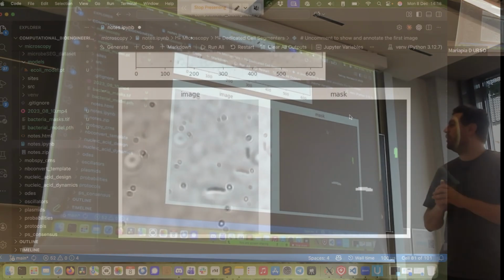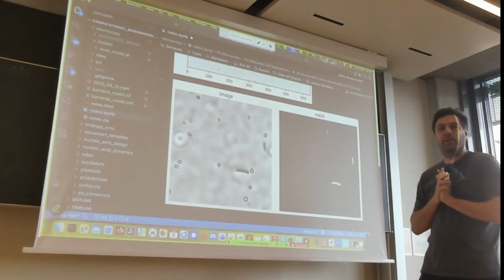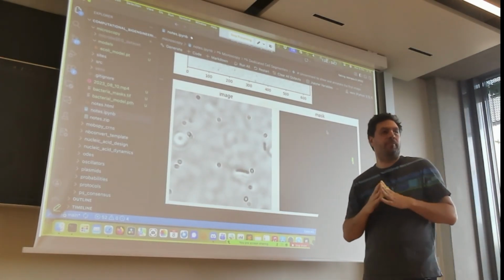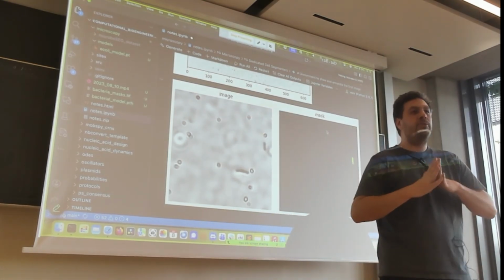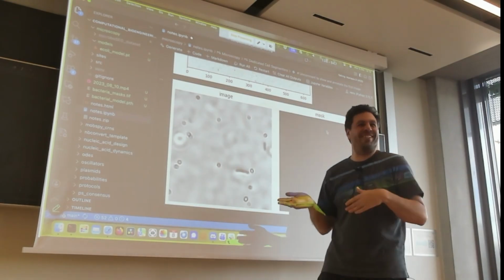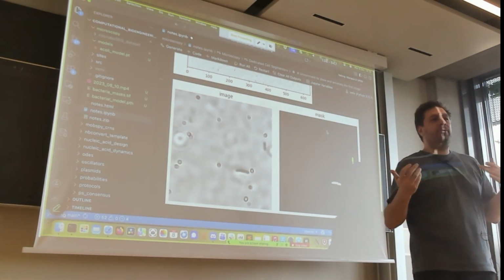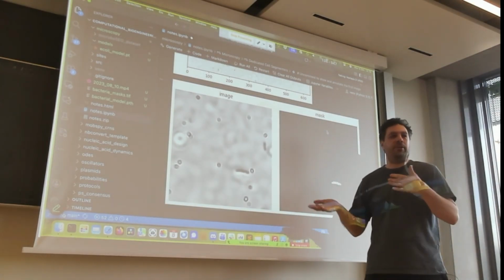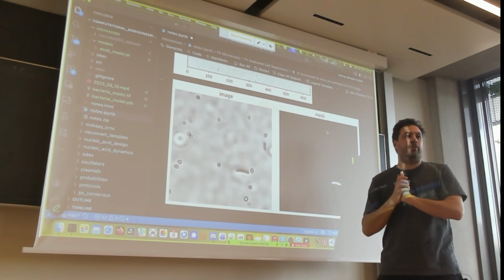I would say it's pretty good, yeah? Like there is this one, and there's this one and this one. So that's deep learning on 2 images. And it's not to tell you that you should deep learn everything on 2 images. This is not the takeaway message from today. It is just impressively good: if you make the right choices, the right augmentations and the right pre-trained models, you can get impressively good results.